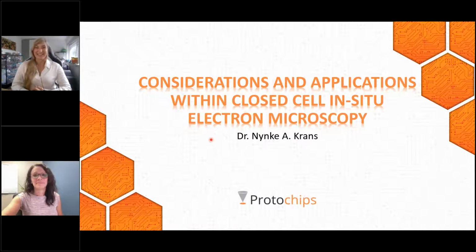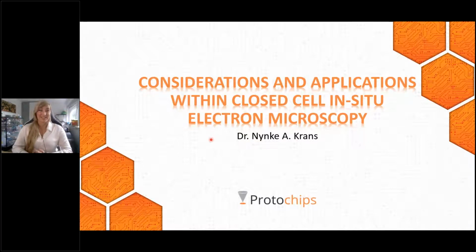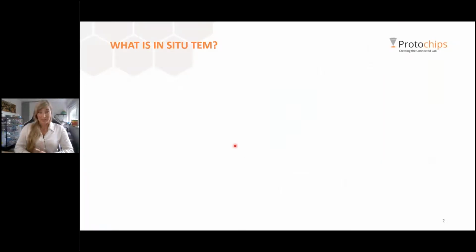Thank you so much. And thank you all for coming and registering for our webinar series. And I'm obviously very honored to kick this off. Today I'll be telling you something about considerations and applications within closed cell in situ electron microscopy, although I will be touching a little bit on other systems that use vacuum in situ microscopy as well. I'll start off pretty basic, but I'll dive deeper into the considerations and experimental preparation very quickly as well.